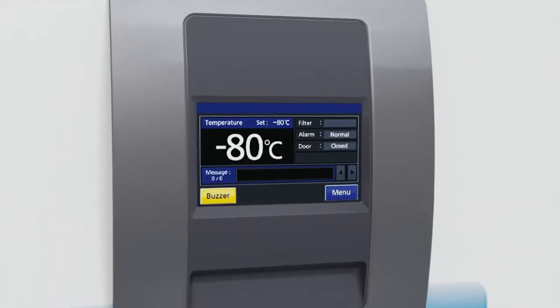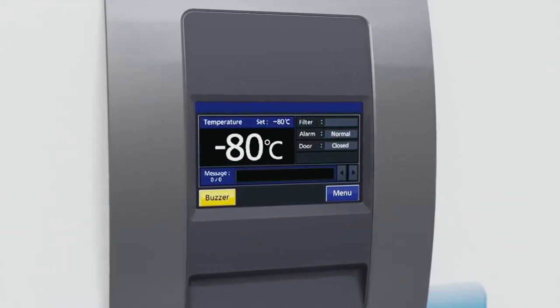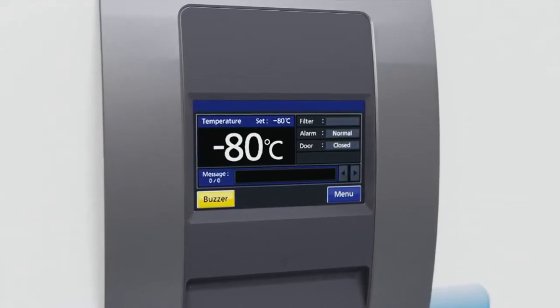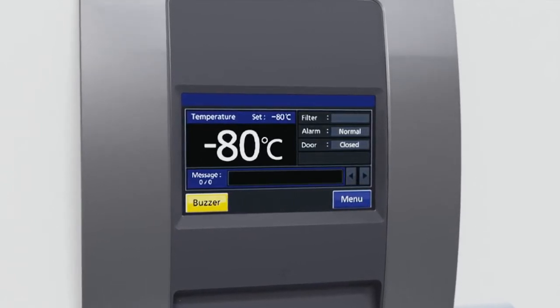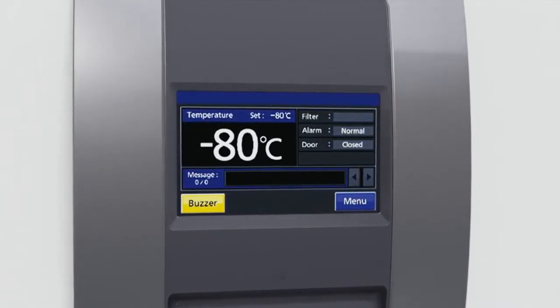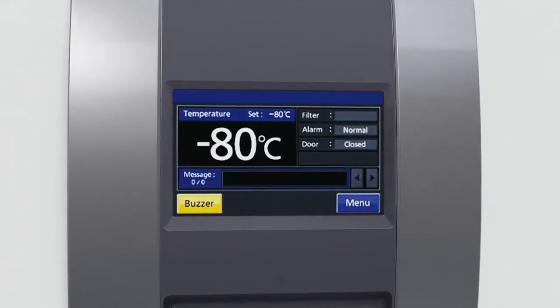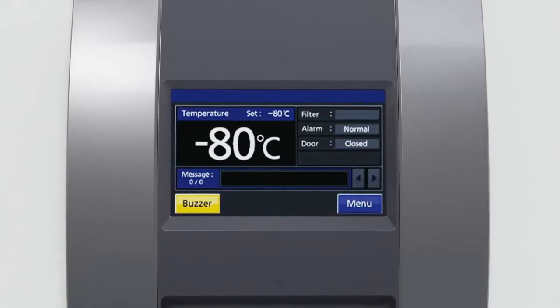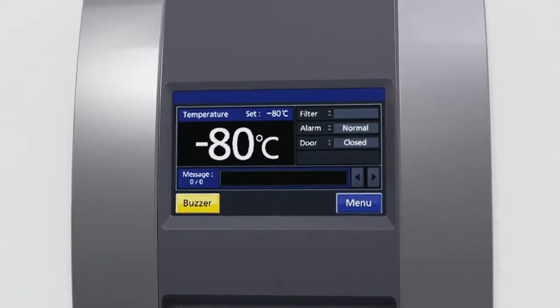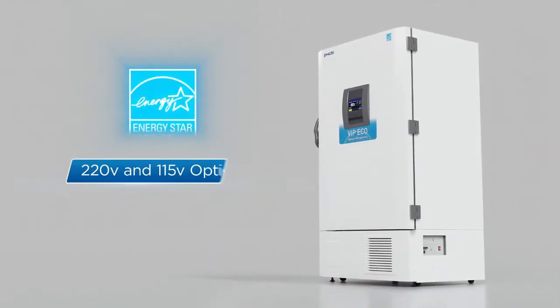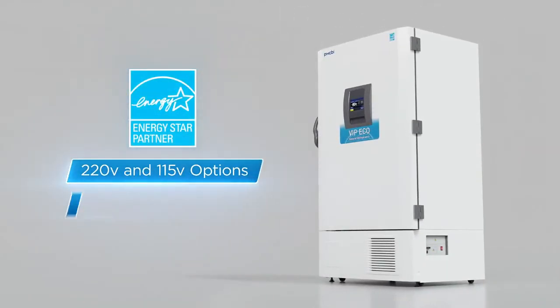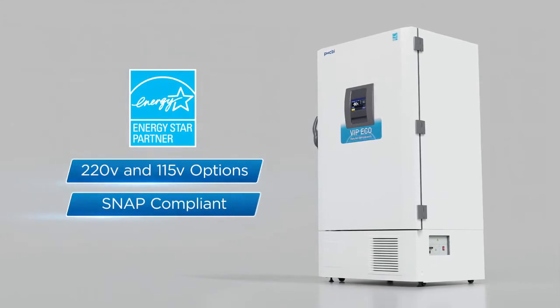Even when the door is closed, the VIP eco still makes the day easier. The LCD touchscreen communicates important diagnostics and warnings while allowing for easy transfer of log data. This advanced combination of features is beyond a typical ultra-low temperature freezer.